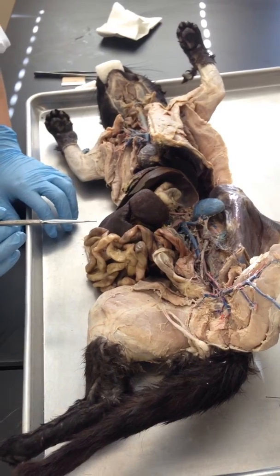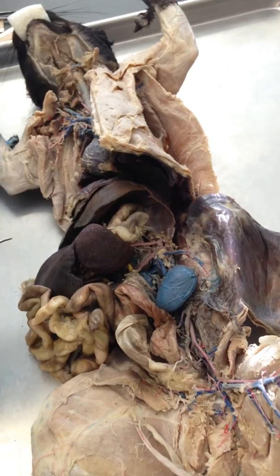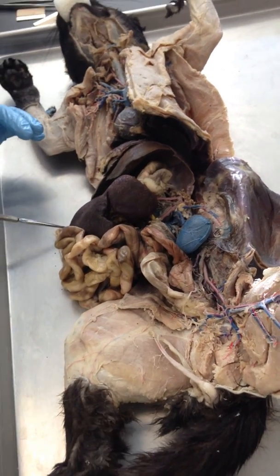I think everything else I can find. This is the adrenal gland. Yeah. Okay. Do we also need to know veins? Of course. Of course.